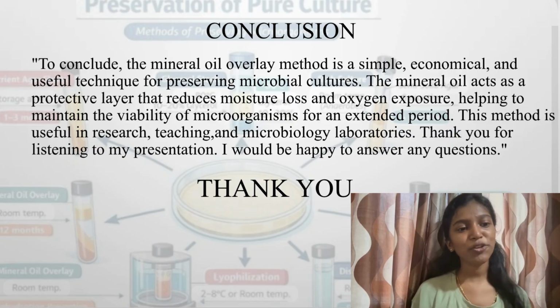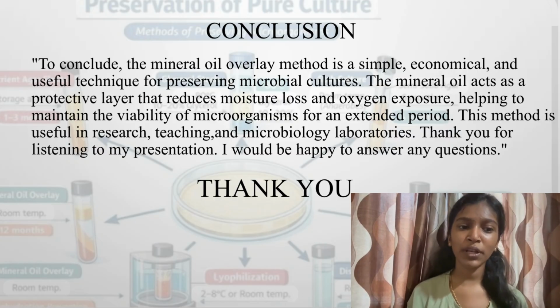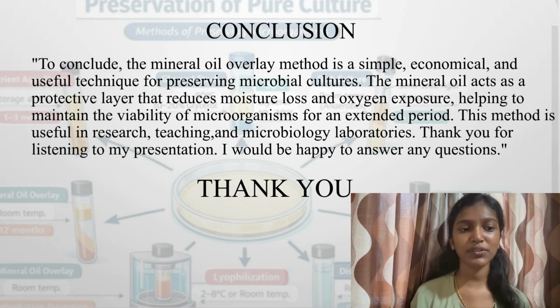At last, I would like to conclude that mineral oil overlay method is a simple and economical technique used for preserving microbial cultures. The mineral oil acts as a protective layer, reducing moisture loss and oxygen exposure, which helps maintain the viability of microorganisms.